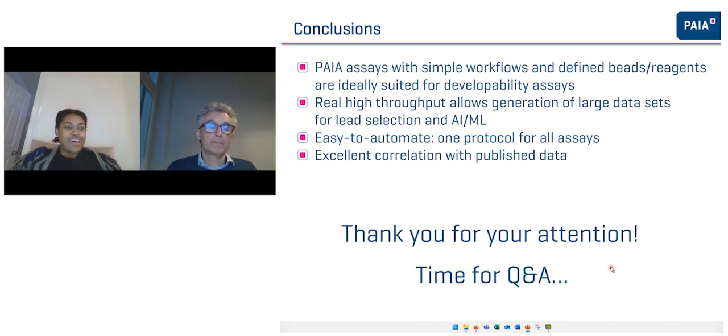Perfect. And the last one, I think this is just to reiterate the shelf life of the reagent. Yeah. So 6 months is the shelf life, and after opening the kit, it's another 3 months. 6 months and then 3 months.